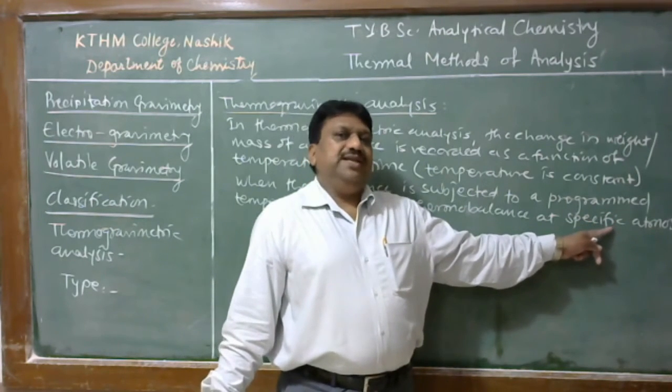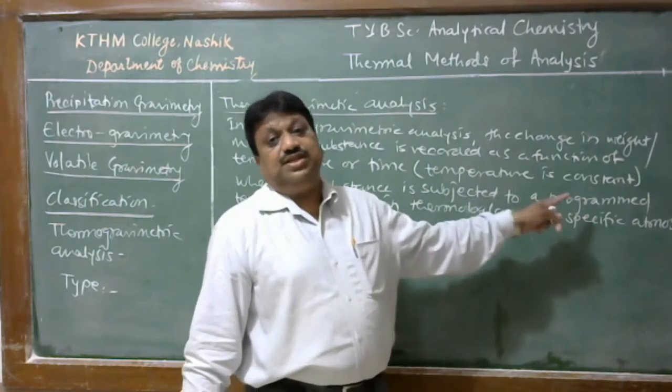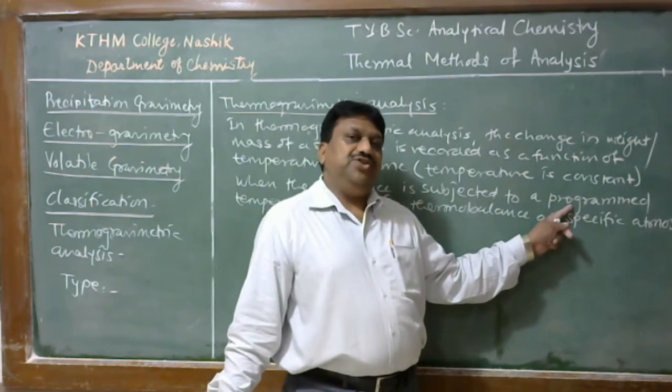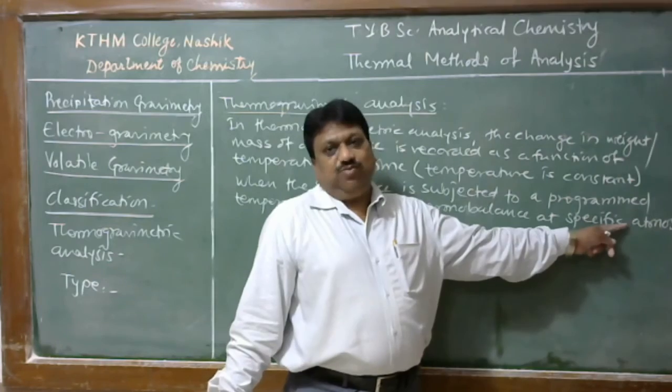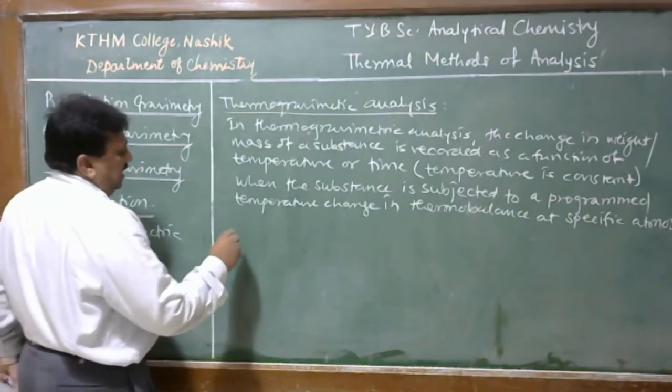This atmosphere is required to study the decomposition temperature of that substance and the effect of the atmosphere on it. Therefore, this is the definition of thermogravimetric analysis.